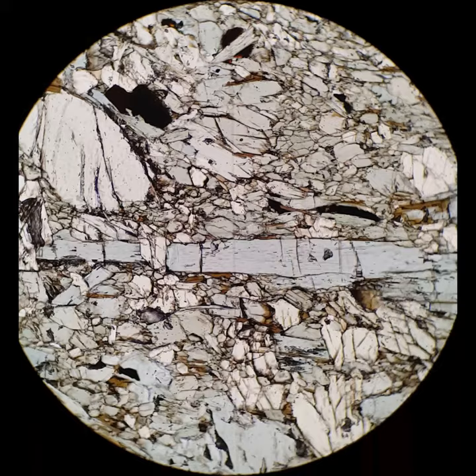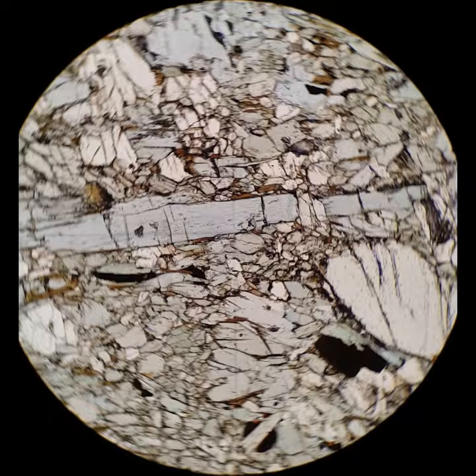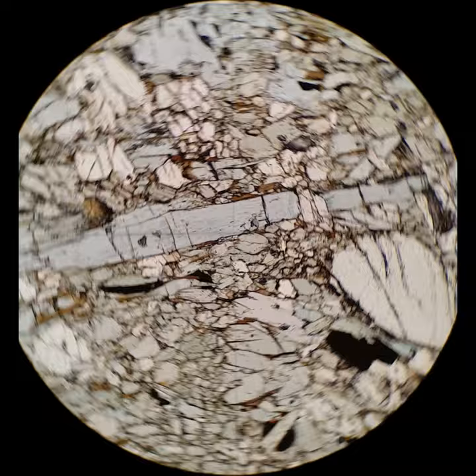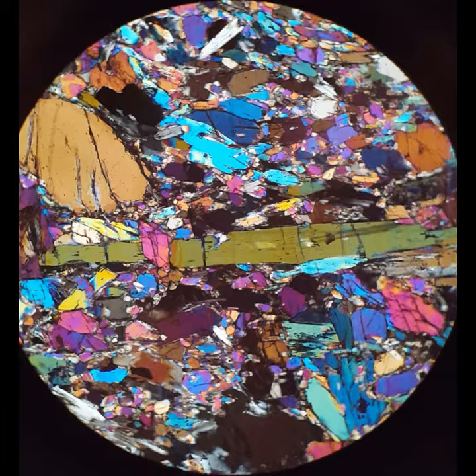An important discriminator of amphiboles is whether they have inclined versus parallel extinction. There's a whole set of orthoamphiboles that have parallel extinction, and clinoamphiboles that have inclined extinction. This is hornblend. You can see that it has inclined extinction, so the long axis of the grain is at an angle to the crosshairs, either north-south or east-west, when it goes extinct. That's characteristic of a clinoamphibole.